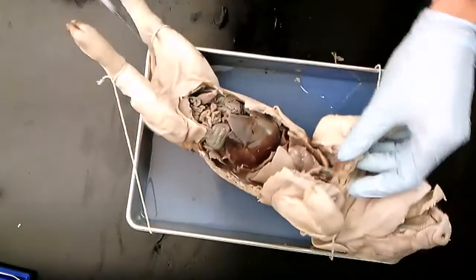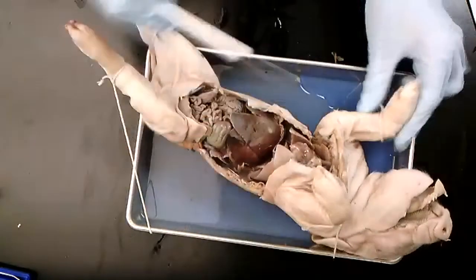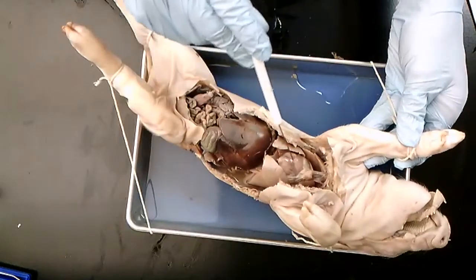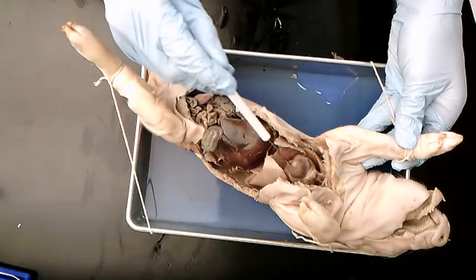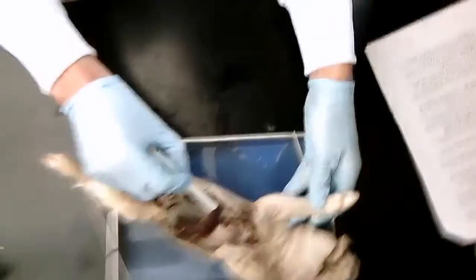So, if you'll notice, does anyone know what this organ is right here? Can you see that? I can get this a little closer too. I'm going to move the camera, guys, so it's a little jostled here.